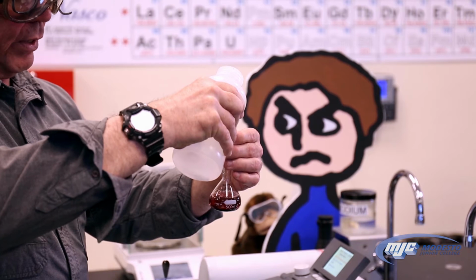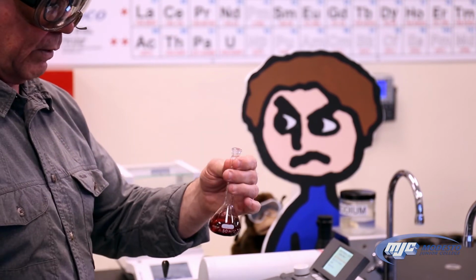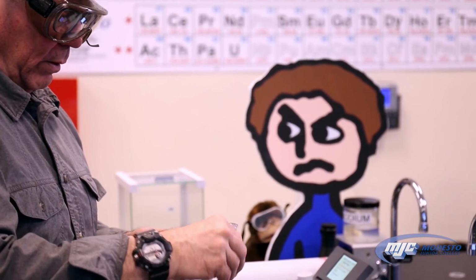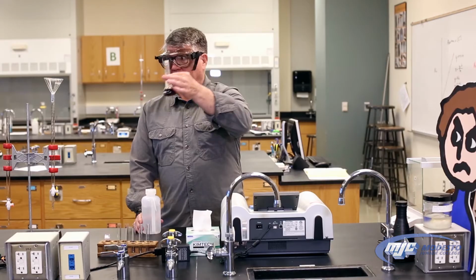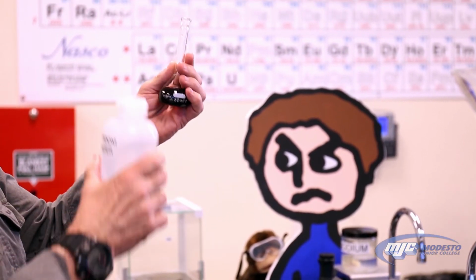Now the cobalt 2 nitrate hexahydrate dissolves pretty easily. Copper 2 sulfate pentahydrate takes a little bit more. So at this point, we're going to have to let it dissolve for a while, swirl a little bit. All right, guys, so now that we have everything dissolved, we're going to add water so that the bottom of the meniscus just touches the top of that line on the neck.